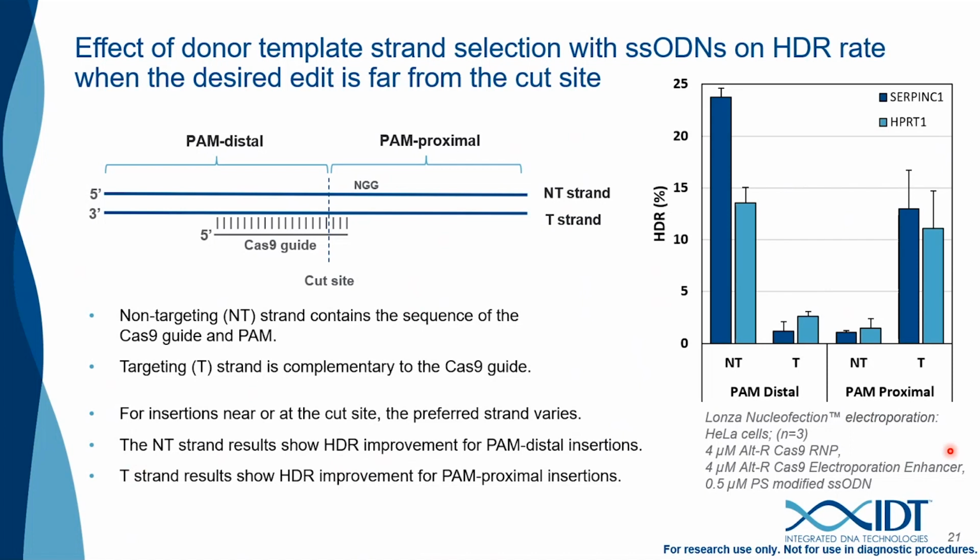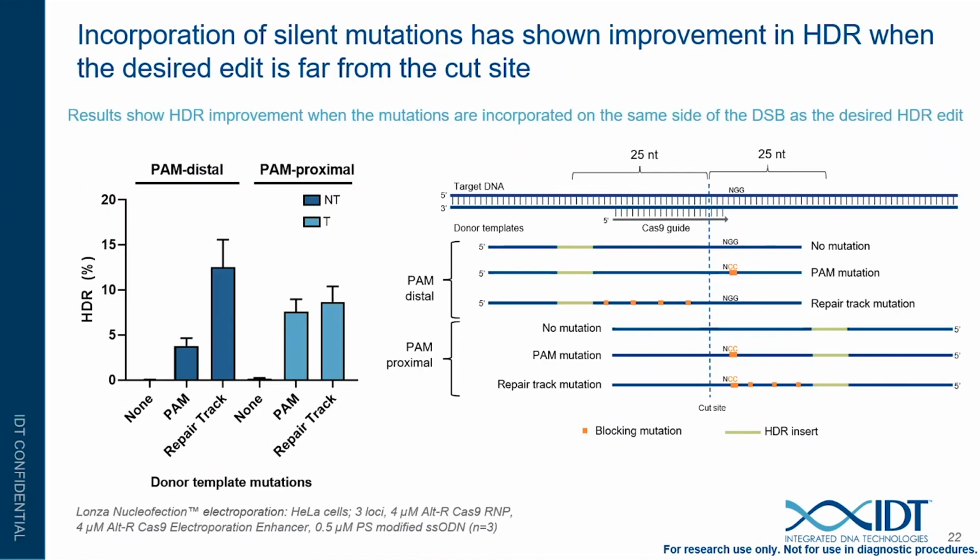I will note that these donors did have silent mutations incorporated to prevent recutting, which I'll get into on the next slide. All right, so we then further investigated whether there were any preferences in the placement of the silent mutations for these types of HDR edits.